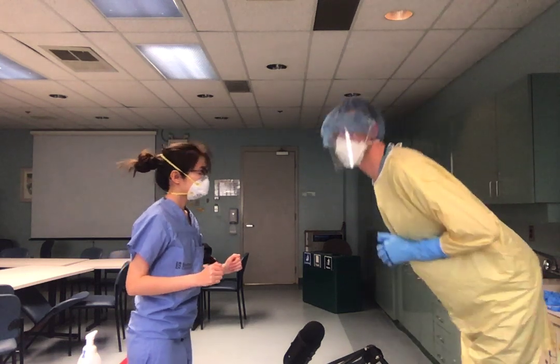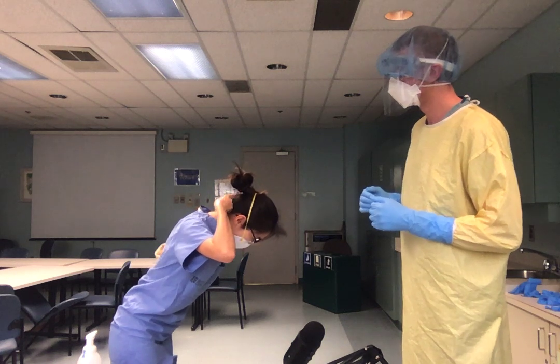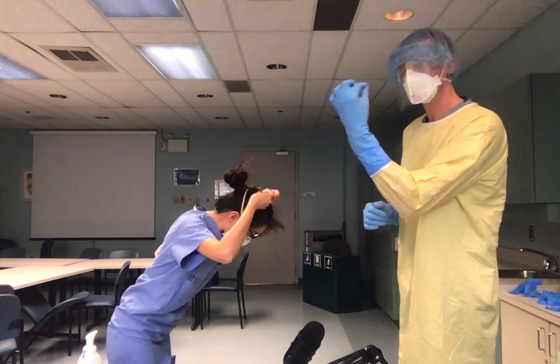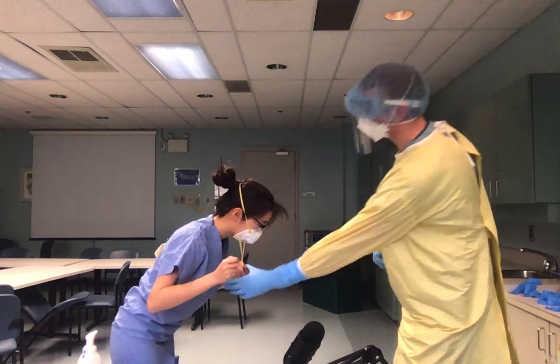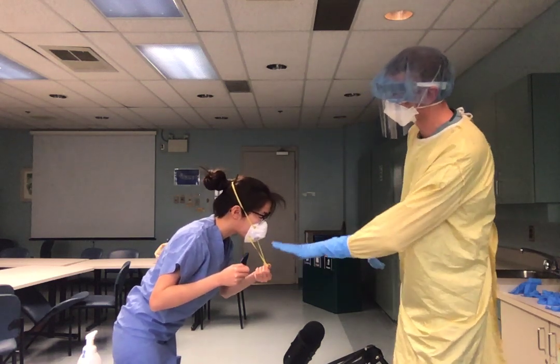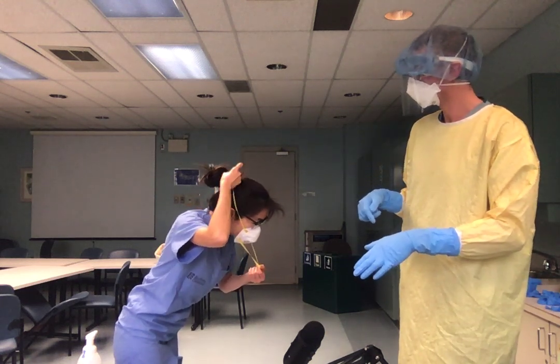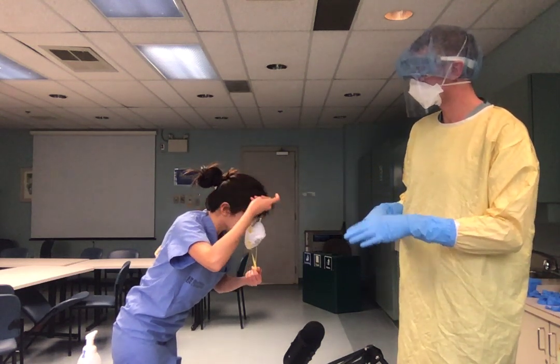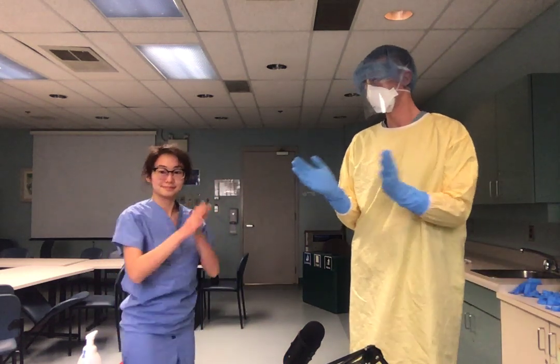Similar body position, hinging at the hips here. Can you grab the bottom strap first, Nancy? And she's going to pull that over and just hold that strap with one hand in front of her. So I'm going to get you to hold it out like this, actually, just so your hand doesn't go anywhere near the mask. And then grab the top strap and slowly pull that forward, and the mask just falls away nicely. Excellent. We're going to wash our hands again.